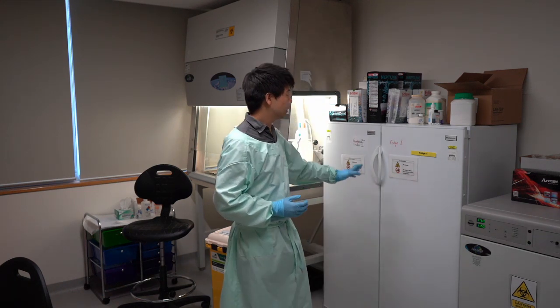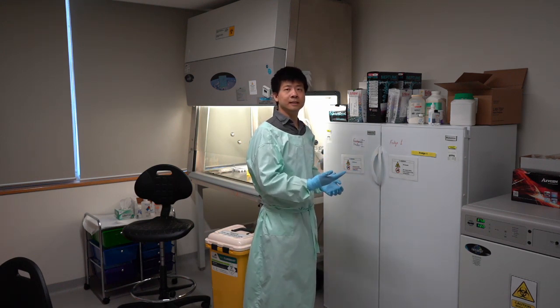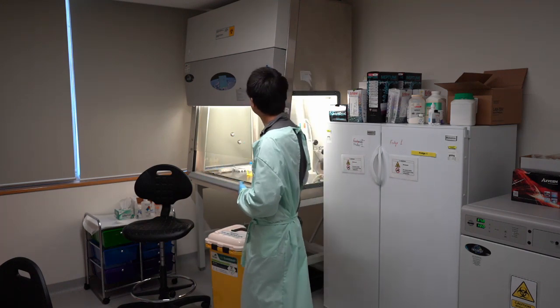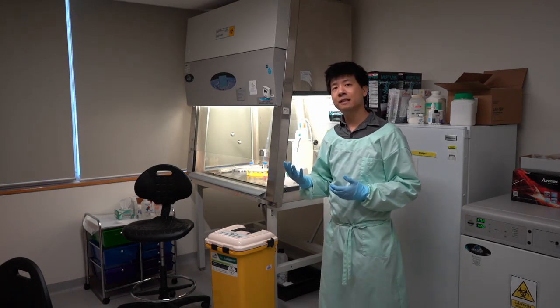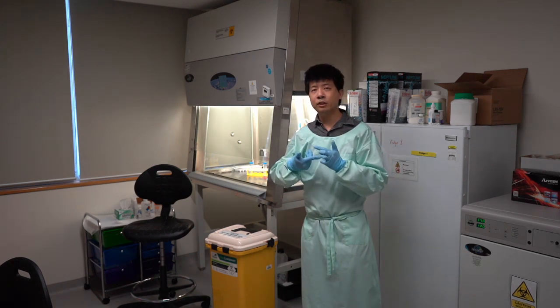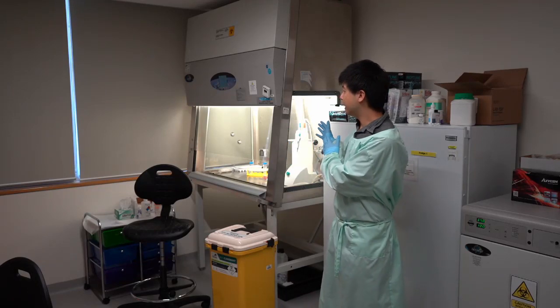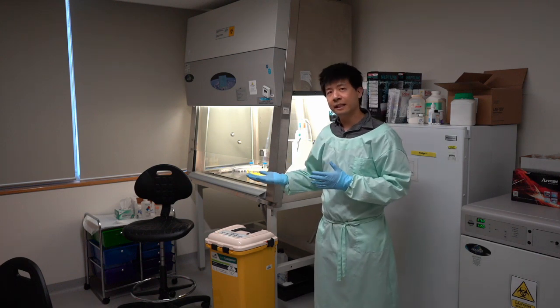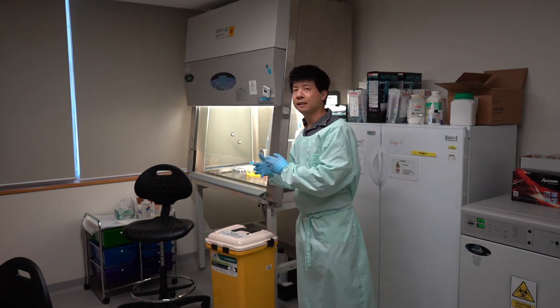We have a fridge and freezer to store all the components required for cell culture. Right behind is a laminar flow cabinet, also called a biosafety cabinet. This is important because in cell culture the cells need to be sterile, and any techniques we perform are carried out inside the biosafety cabinet, where everything brought in or performed inside remains sterile.